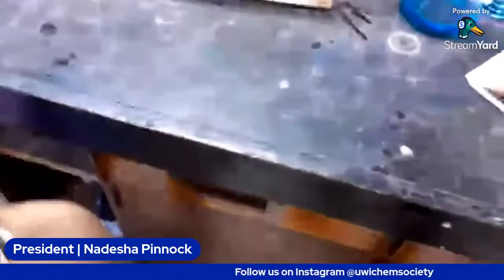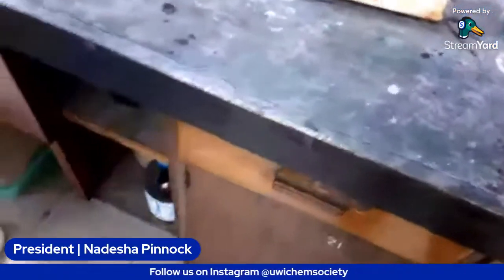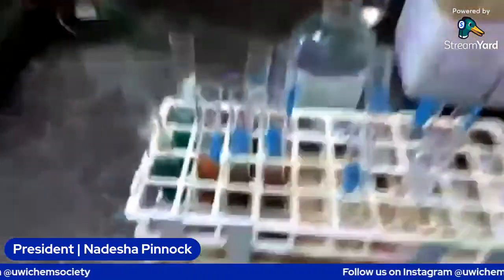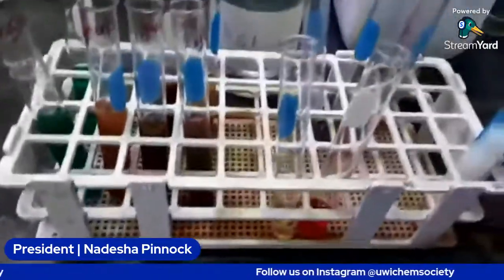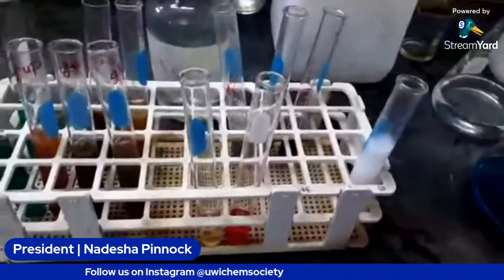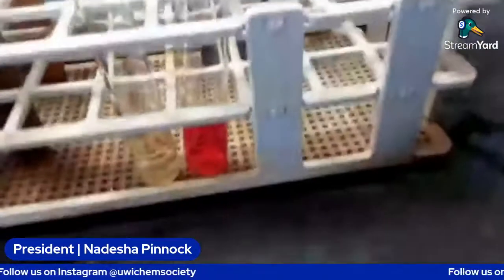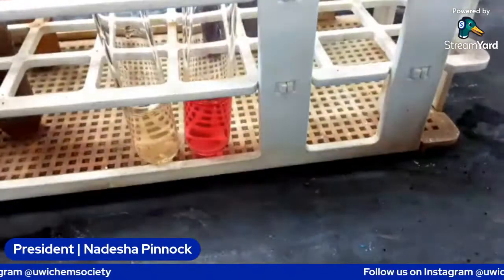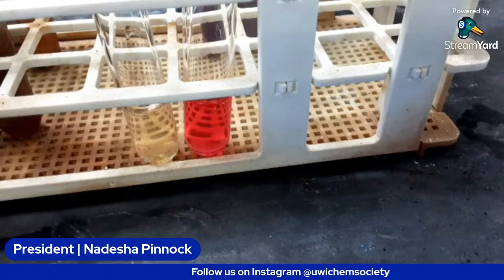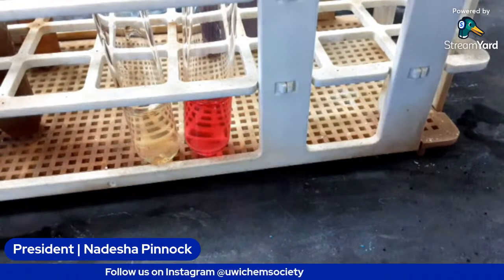So we're at syrup and fruit juice. So we have the sucrose, the syrup. We're going to add some acid to it. Alright, so I'm going to wash out the drop that I had.